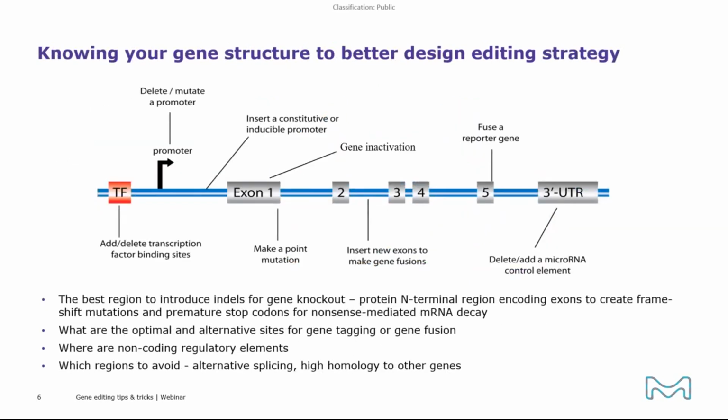Before embarking on a gene editing experimental design, it is also highly recommended to know the structure of your gene of interest in as much detail as feasible. This will help you to find the best place to introduce indels for gene knockout, to tag the gene, alter the gene function, or regulate the expression.